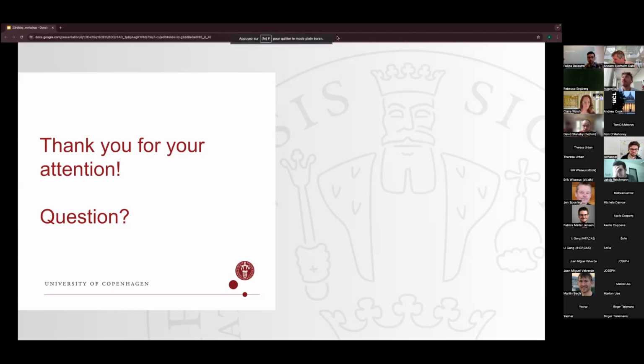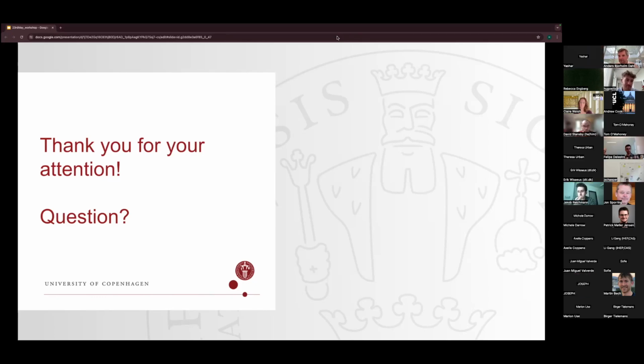I have a question, and perhaps I'll start with a comment, because it's typically what we see: starting by downsampling the very nice high quality data that has been acquired. This forum is for sharing ideas and tools, such that we ensure we utilize the high resolution. It's not only in the analysis phase, but also in the exploratory phase, where you need to zoom into regions and see things.